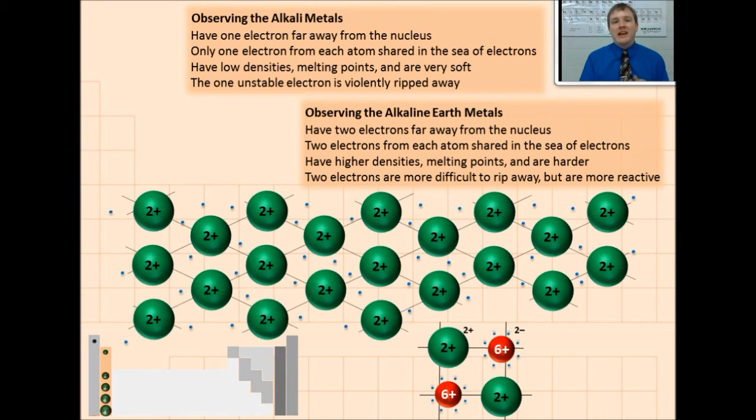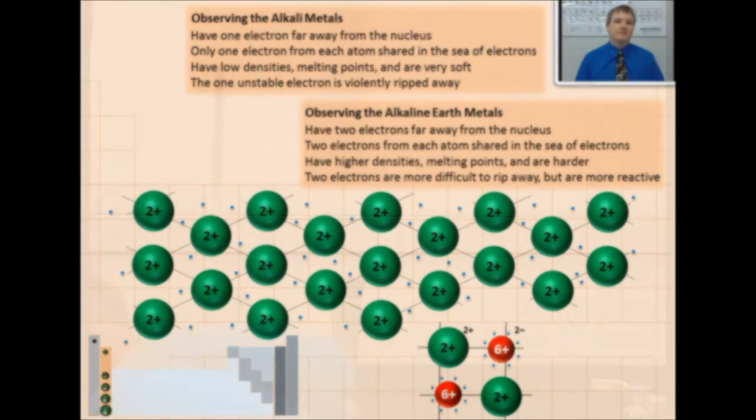Magnesium is so reactive that it's going to release a tremendous amount of energy in the form of light. In fact, if you were doing this in person and not through a video screen, you would have to be very careful not to look directly at the light that's being produced by this reaction because it's so bright it can damage your retinas. Now I will show you what happens when you burn magnesium.